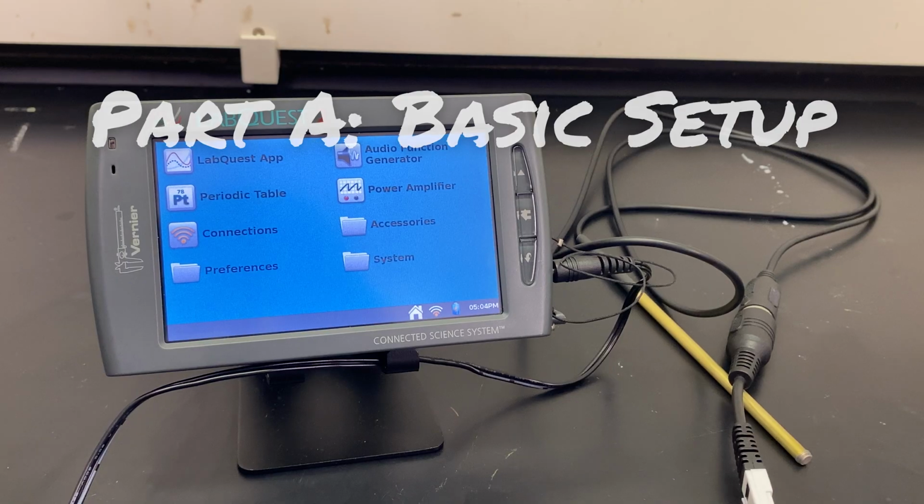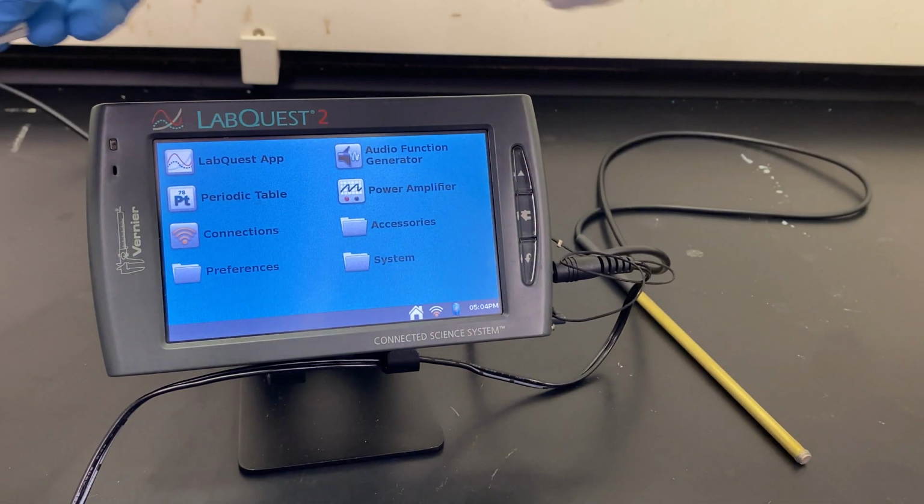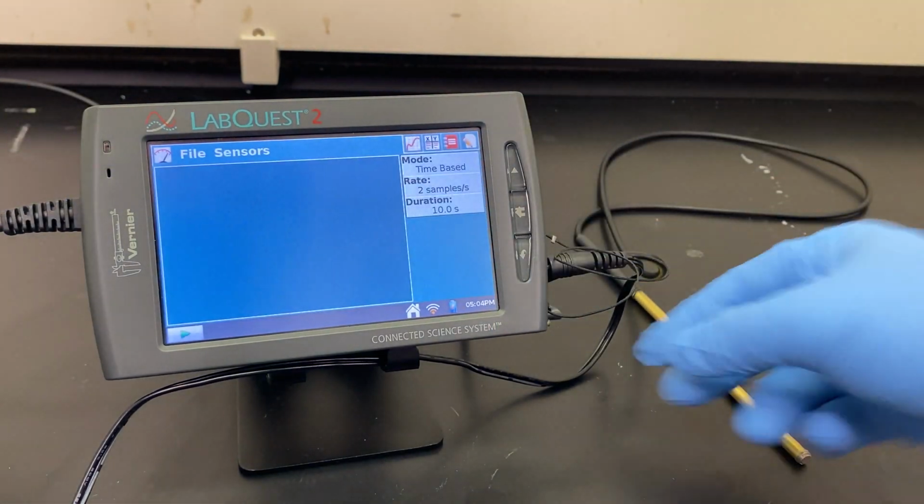Part A, Basic Setup. Attach the temperature probe to the LabQuest 2 device. Then open the LabQuest app.